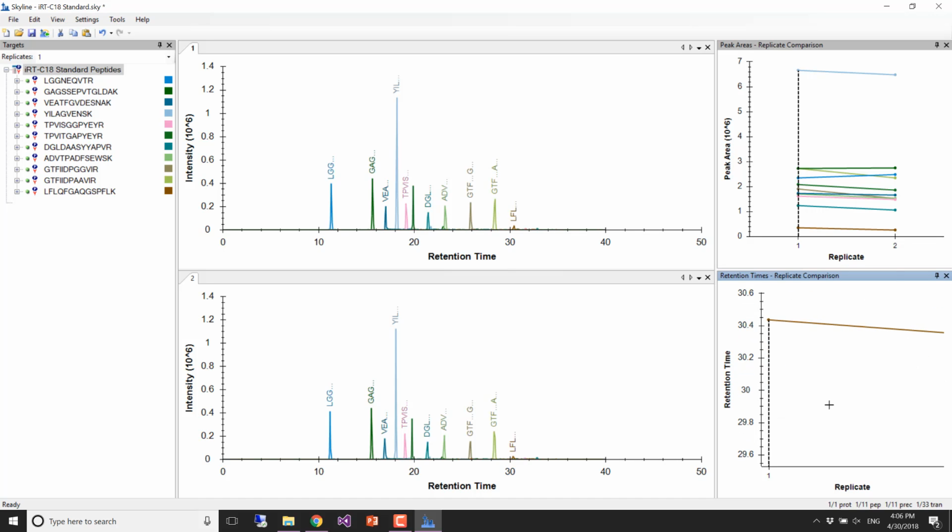you can see that there is actually some slope. So which run is eluting earlier? Yeah, the second one. So we're seeing some downward slope between 1 and 2. Right? Okay. So if we did alignment on these, we would expect to have an equation between the two that had the second run coming out a little bit earlier, maybe just a few seconds earlier.